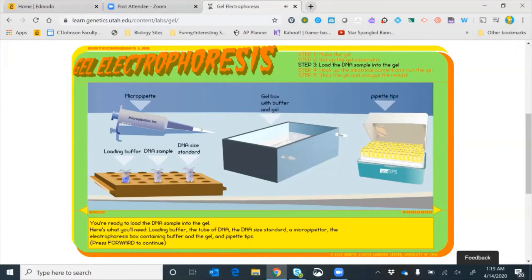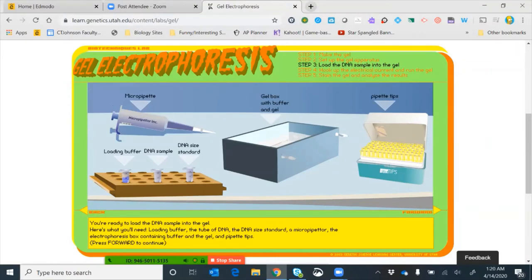Now we're ready to load the DNA sample into our gel. We have a micropipetter, our gel box already set up, a DNA sample containing fragments we want to identify, a DNA size standard — also called a DNA ladder — and loading buffer.